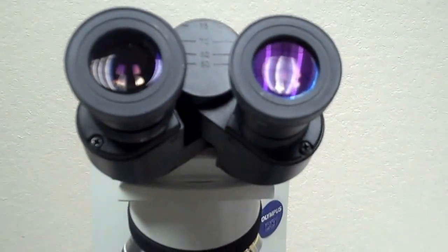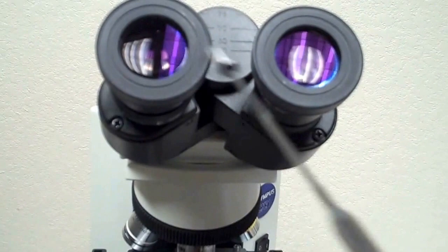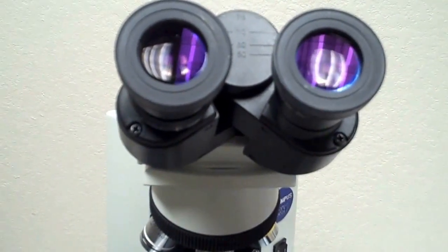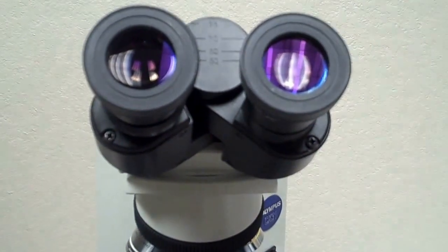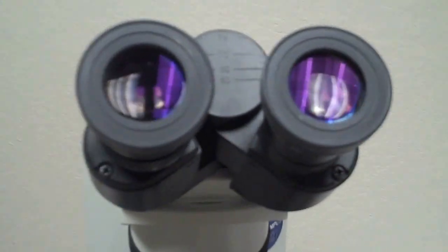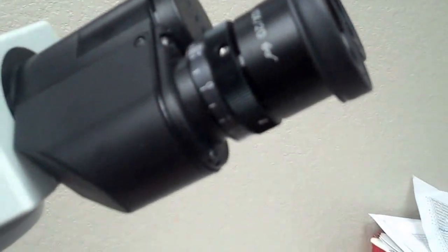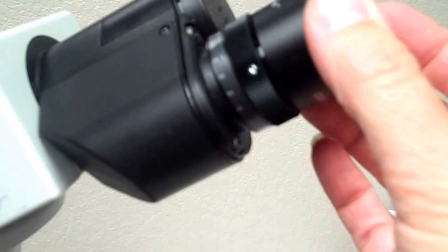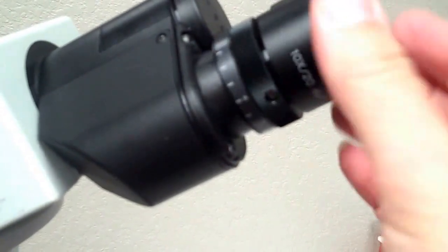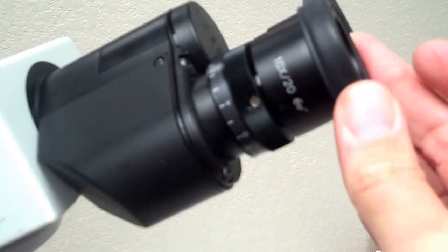This is a binocular microscope so it has two oculars or eyepieces, which allow you to view the specimen and have a magnification of 10x. Our microscopes are also fitted with a diopter ring on one of the two eyepieces, which allows you to adjust for the fact that your two eyes might not have the exact same vision or prescription.